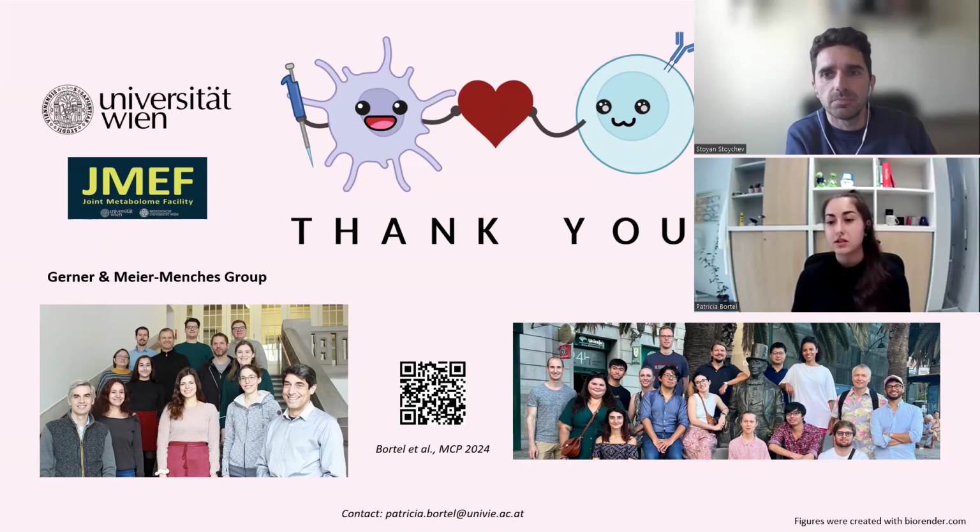Okay, great question. For the very initial evaluations, we only went up to 30 microgram because that is the optimal input amount for the Whisper gradients on Evosep One, which are made for rather low peptide input amounts. But for the sequential enrichment, it would definitely make sense to do this for more than 30 micrograms, because you saw this trend that when you use more peptide, you can also get a gain in the rather later enrichment rounds. So we didn't test it for more than 30 micrograms, but I would expect that you can also get a significant gain with more than 30 micrograms.